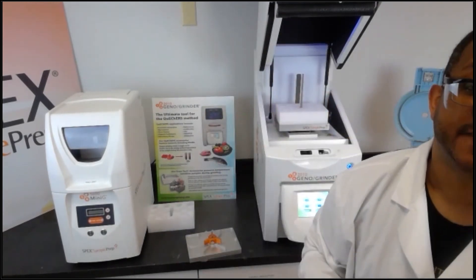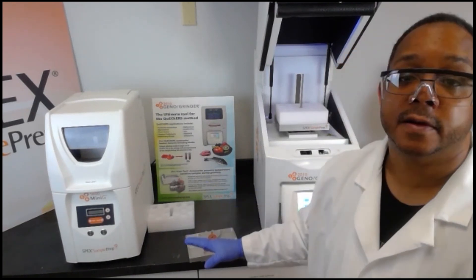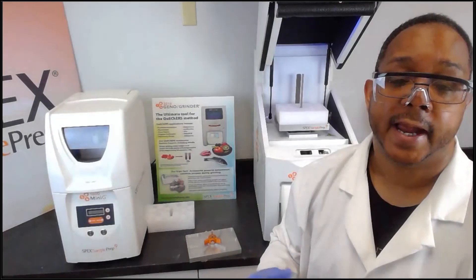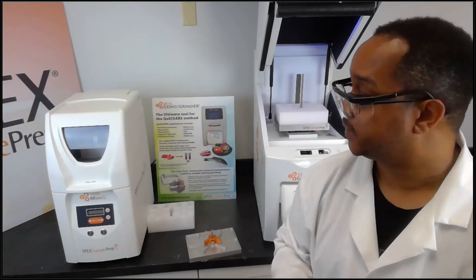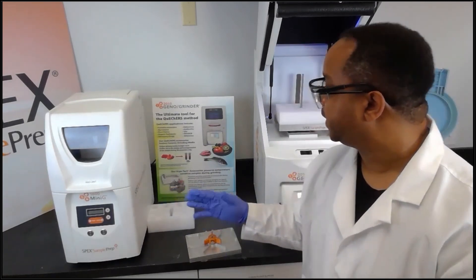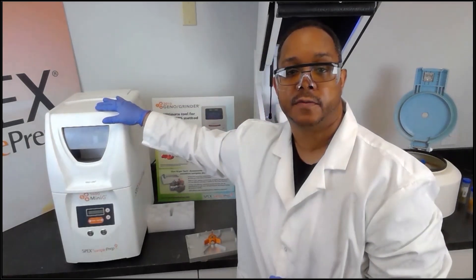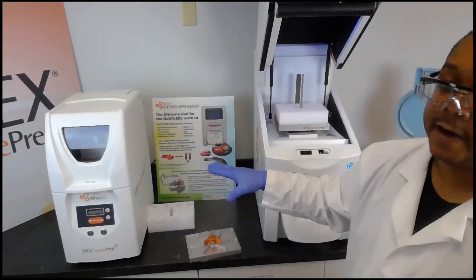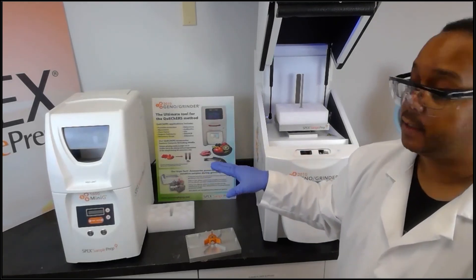This concludes the brief demonstration showing how the GenoGrinder can be used to replace the manual hand-shaking method used in the QuEChERS method. I also want to mention this is our smaller homogenizer, which we call the 1600 Mini-G. The 1600 Mini-G is very similar to the GenoGrinder except the sample throughput is a lot smaller.